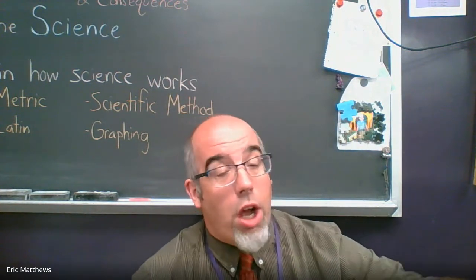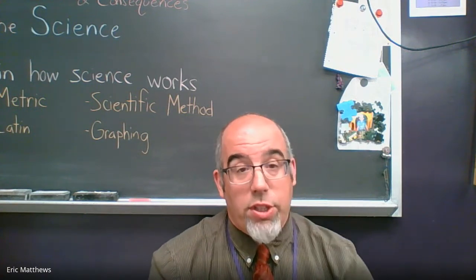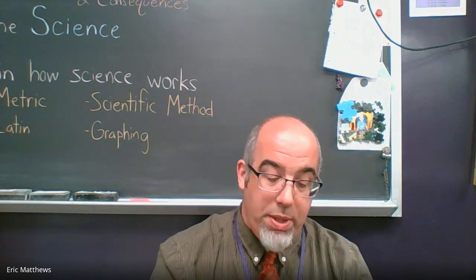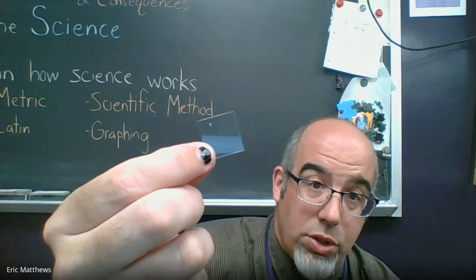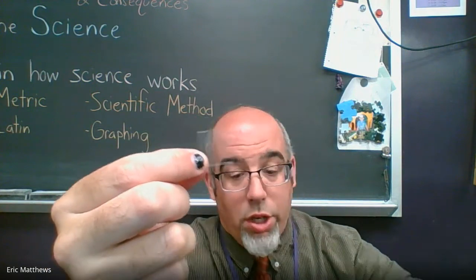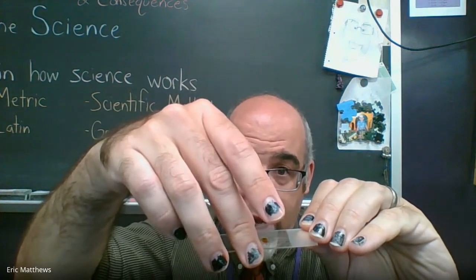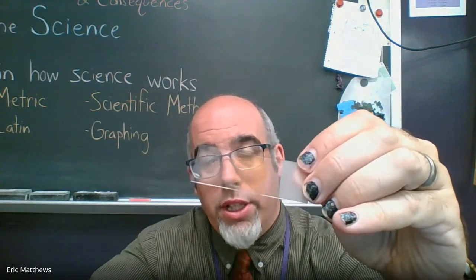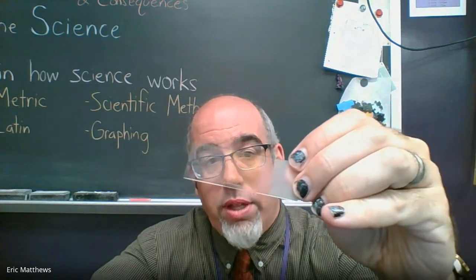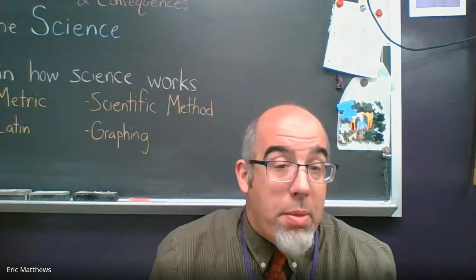Then you're going to want to take a cover slip. This is only to protect the microscope from the sample. Cover slips are small, square pieces of plastic that are sitting on each of the lab stations with the extra slides. You're going to take this and set it down so that it covers up the iodine. So now what you should have is a slide with that discoloration in there. And that's what lets you know that the iodine is secure. Notice, it won't fall off. And now you want to take a look at that under low, medium, and high power.